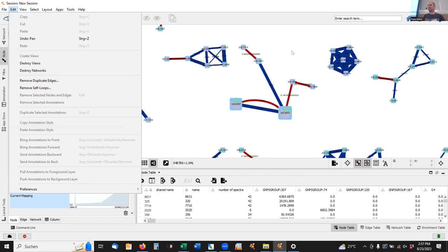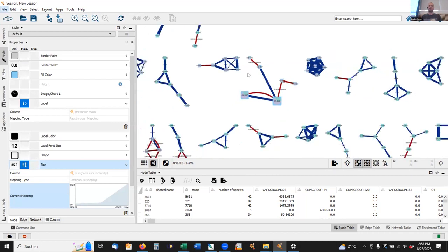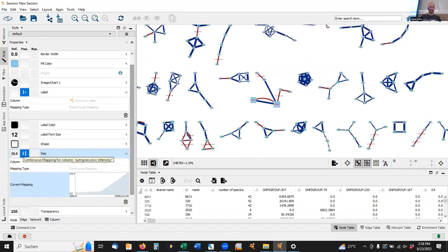And as Camilla mentioned, there's a bunch of different add-ons, or now apps, they call it, to use different styles. One problem that I often faced was that nodes were overlapping, and then I think it's the yFiles app, you can download this and then remove overlaps, right? Here on the very bottom. This is super nice, right? If you especially messed up the size, then you can use such tricks to clean up your network or restructure it.